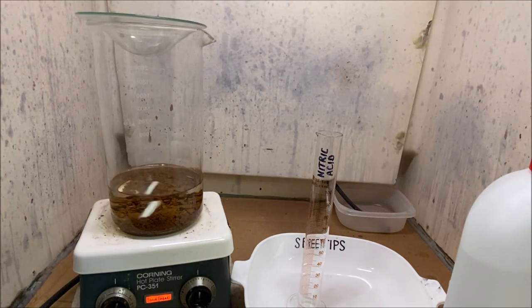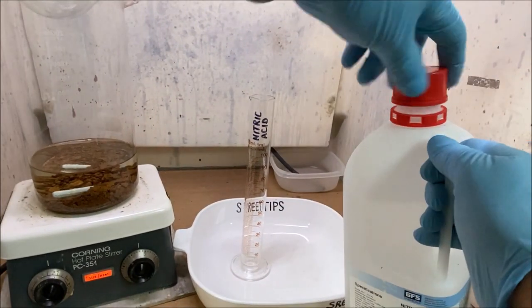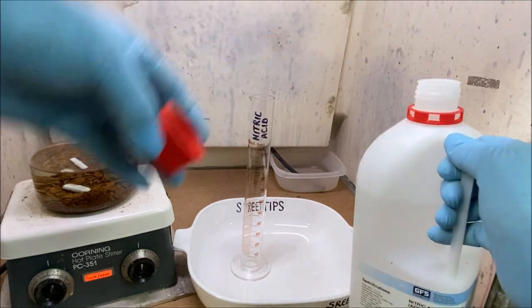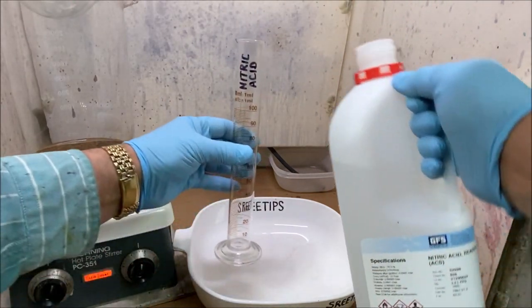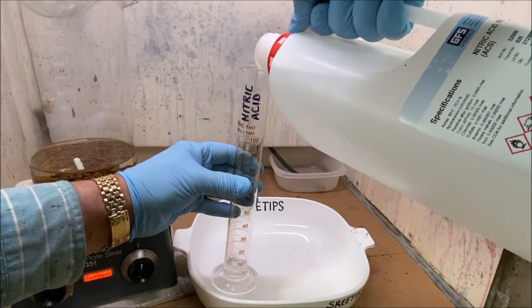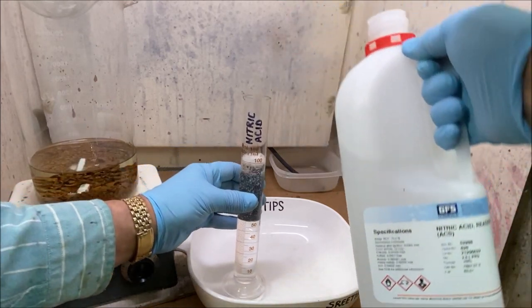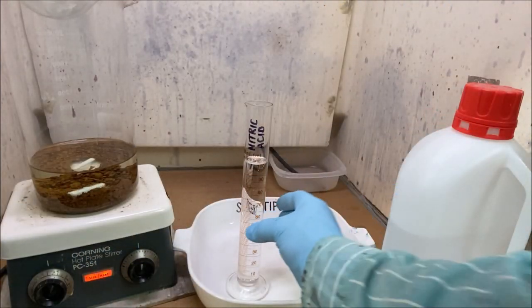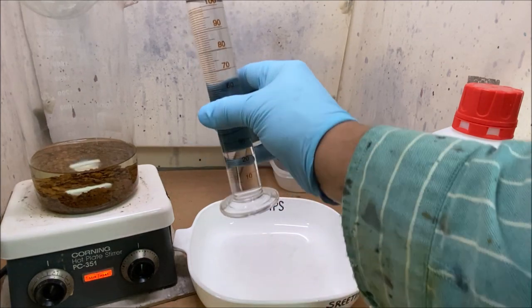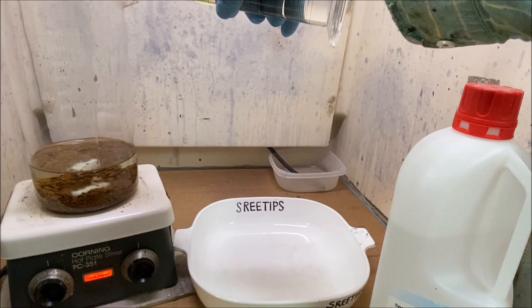And while we're waiting for that, over here I'm going to measure out 100 milliliters of nitric acid. To get this started, I'm going to add about 20 milliliters of the nitric acid in here to form a little bit of aqua regia.